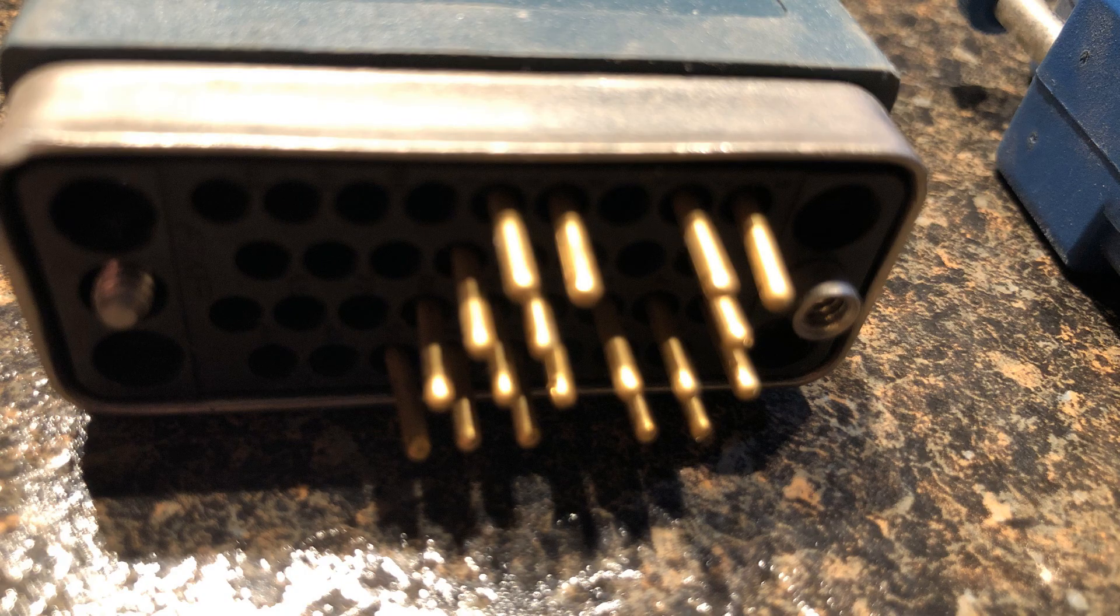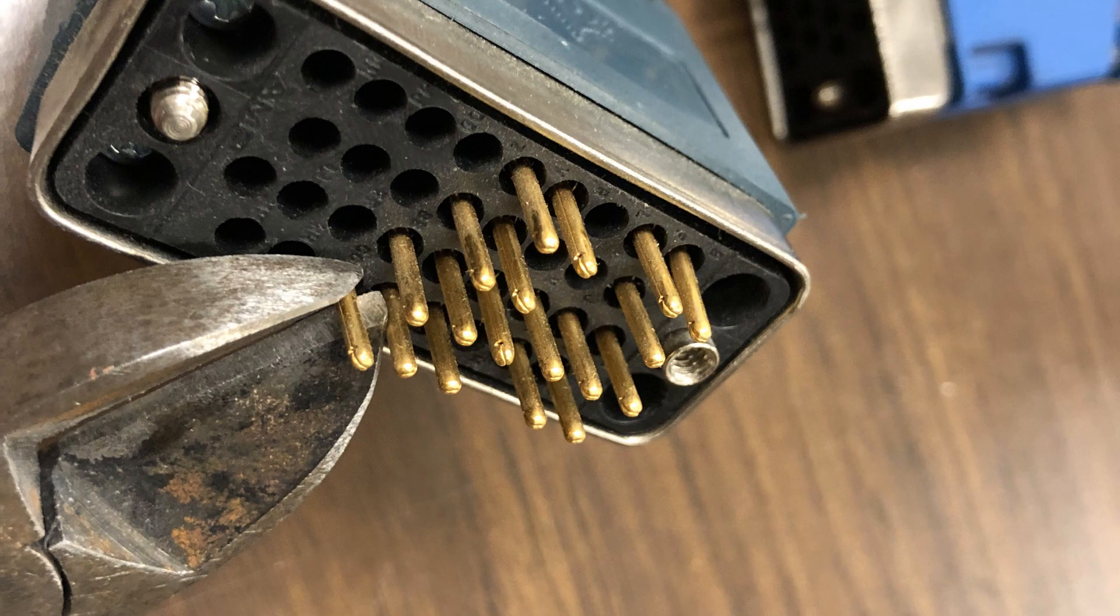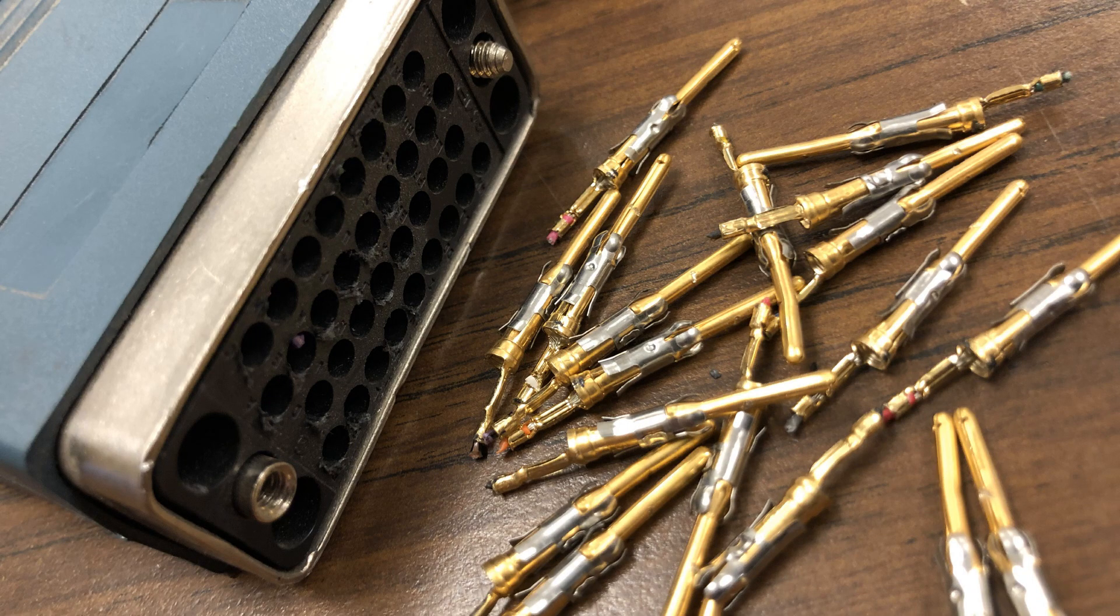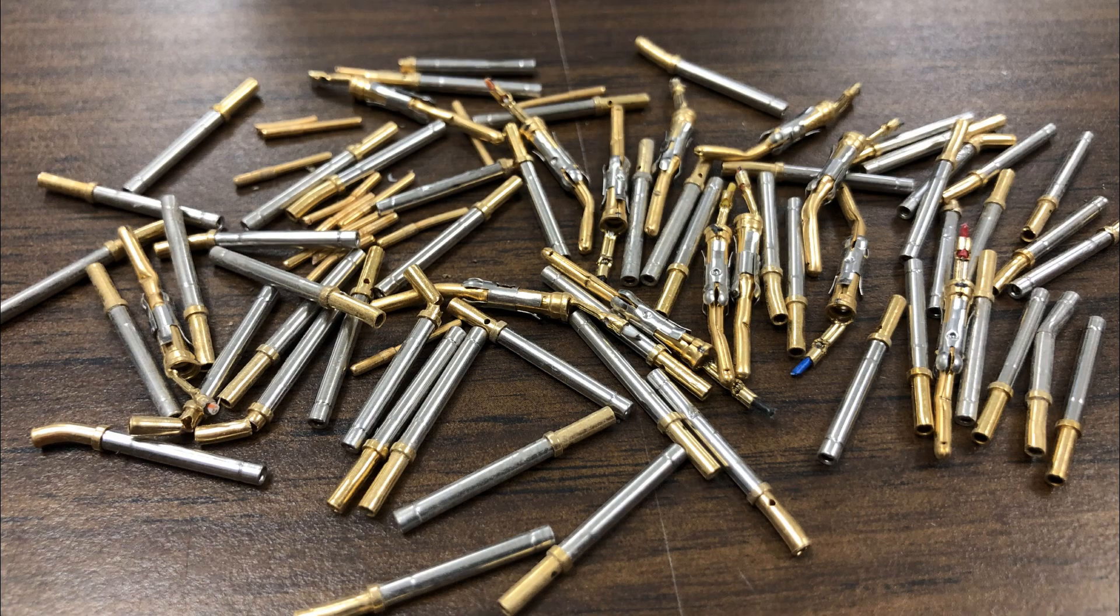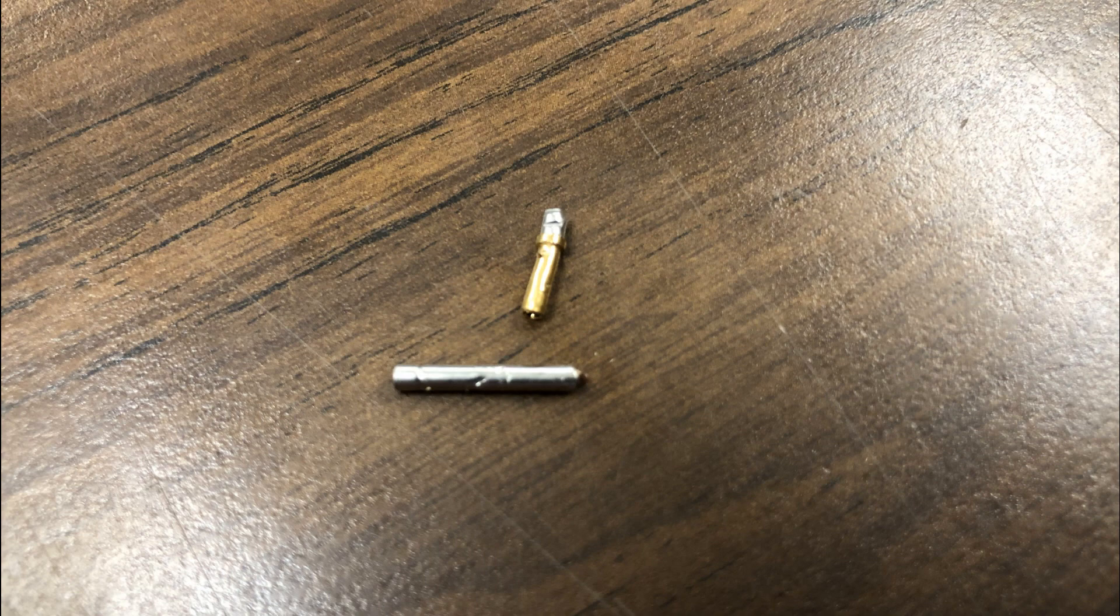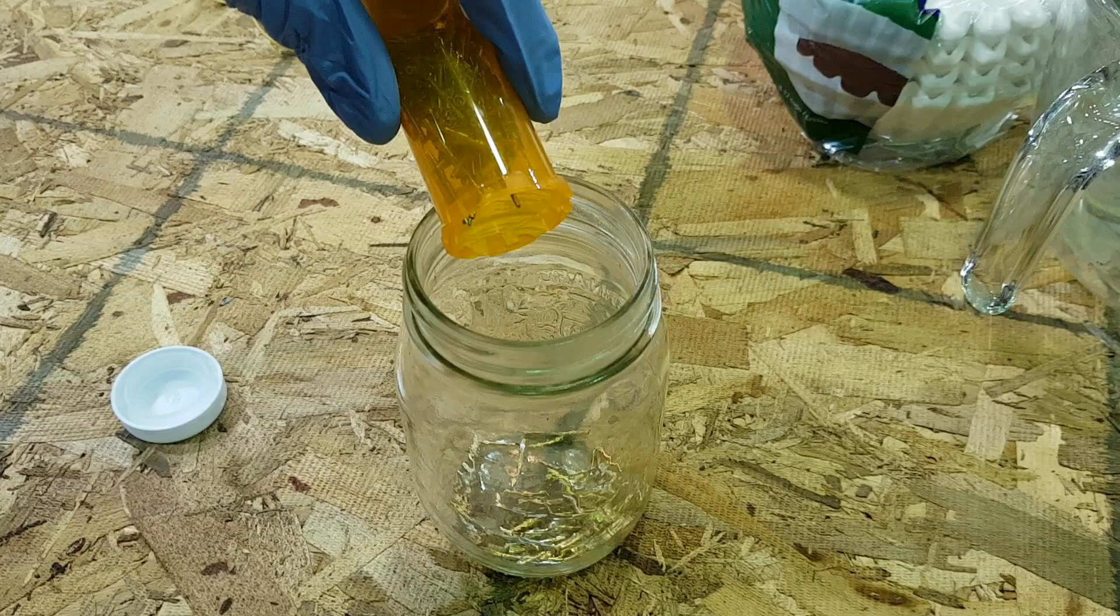So step one in this process is fairly simple. You're going to want to remove the pins from whatever they're attached to. Typically what I do is grab a hold of them with a pair of side cutters and pull out of the cable. Once you've pulled the pins out you should be able to see a fairly distinct dividing line where the gold plating ends. You're going to want to cut each pin before that dividing line so you get all the gold plating but you don't need all that excess metal taking up the materials in your process.